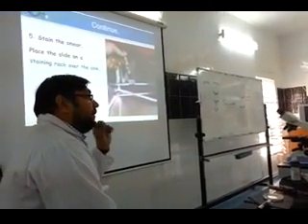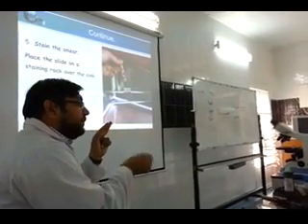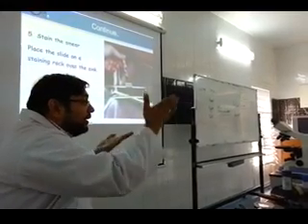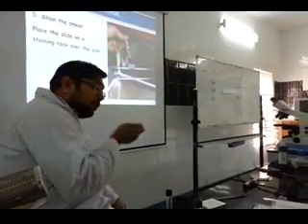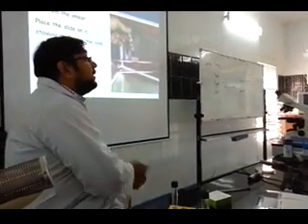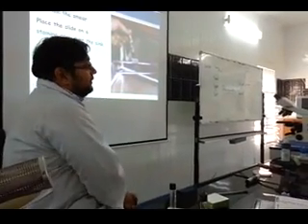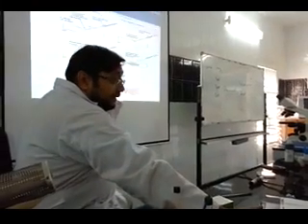Okay? So for the smear, sterilize your loop, take a drop of water, mix, and make a big, thin film, like you said in hematology, a thin film. Okay? Then air dry, not over the flame, okay? And then you fix it, to make the bacteria stick to the slide. Okay? Got it? Next thing.